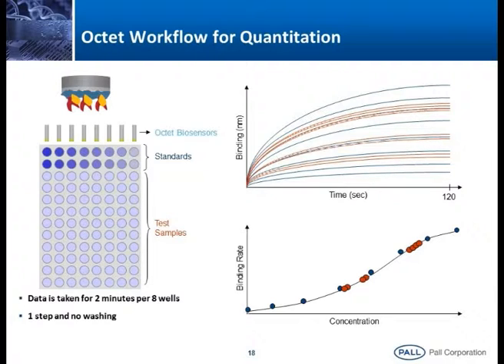But here the advantage is that it is purely affinity based. In the case of UV, I am giving an example, you people are performing the Bradford assay, right? What you are doing is a total protein quantitation, not exactly the protein of your interest. Even in the case of HPLC, it is 280 monitoring, it is once again resolving, but even though you do not know how pure your peak is, there may be some other proteins which have the same hydrophobicity, and will elute at the same time. Here it is purely an affinity based interaction. If you have a specific antibody or a specific receptor, then we can easily quantitate how much protein is in your expression.